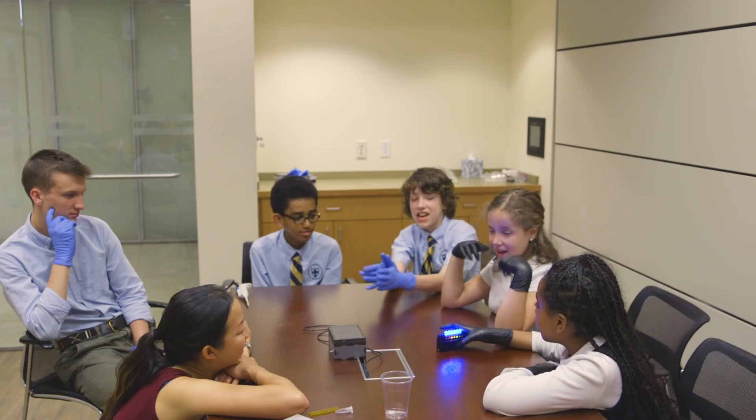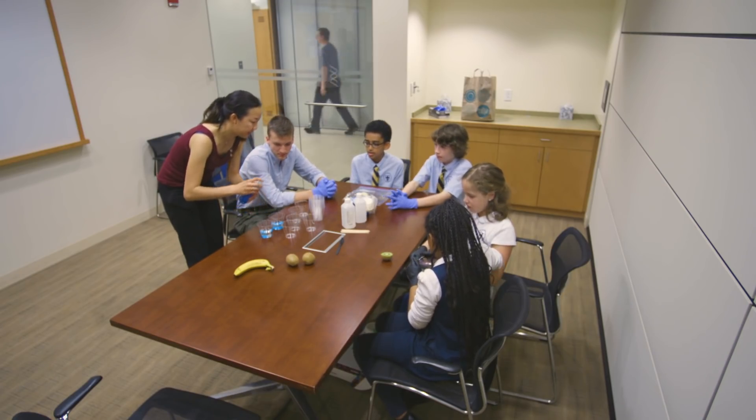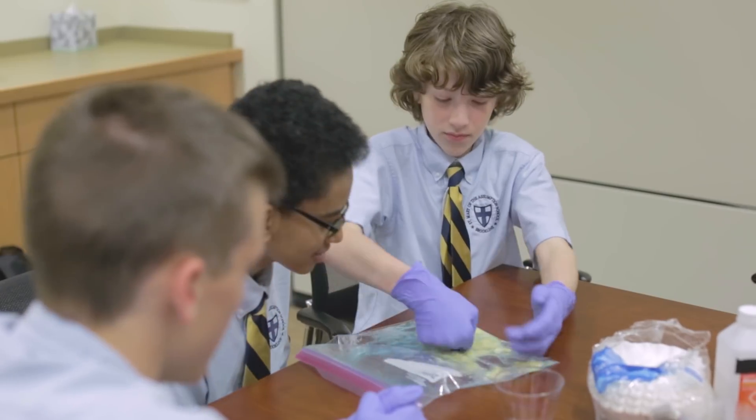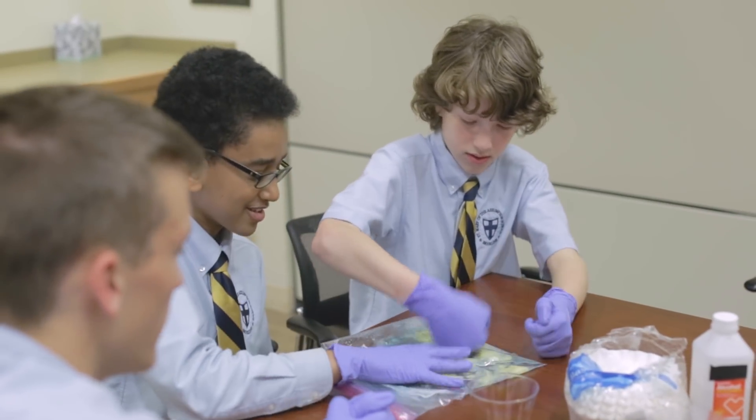In our second lab, we give students a 96-well plate of freeze-dried cell-free reactions and challenge them to build their own in vitro synthetic program — in their case, painting a picture with these fluorescent protein reactions. They can make a rainbow, a periodic table, and that allows educators to start talking about how synthetic biologists might control biology. While the Bright kit focuses on expression of fluorescent proteins, the Explorer kit introduces new modules that go beyond simple fluorescent protein expression.